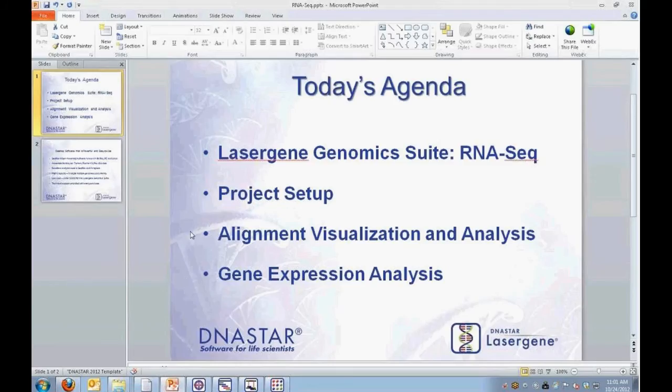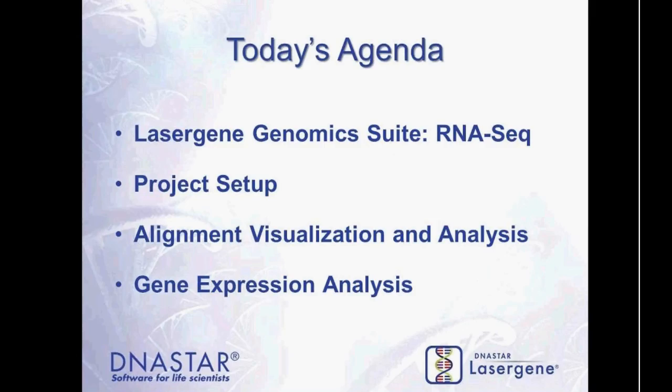Thank you, Katie. Thank you for joining today's webinar presentation for the RNA-Seq workflow. We recently introduced Lasergene 10.1 last month, which integrates our analysis and alignment tools in one package with easy-to-use workflows that you can go through without changing any higher-level parameters like most other software tools.